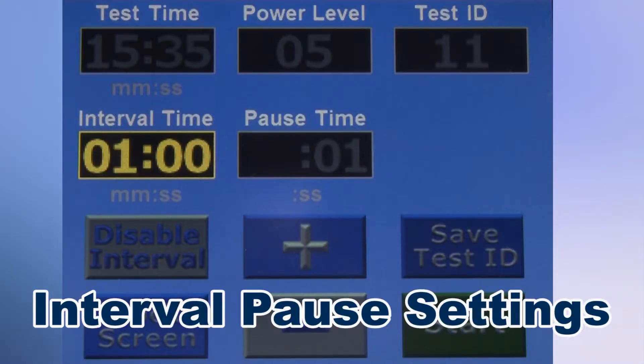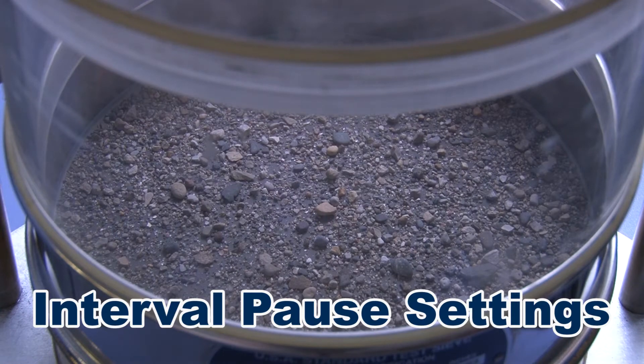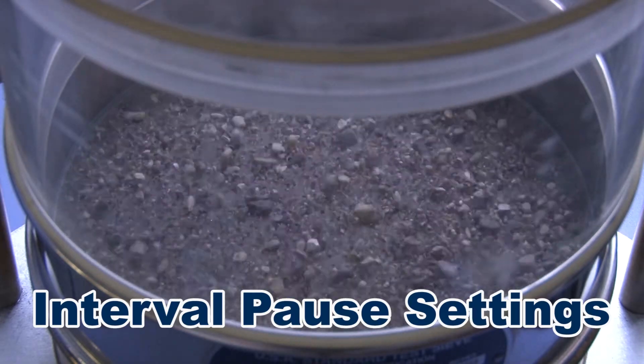The SS10 also has an interval pause feature, where pre-programmed vibration pauses allow materials to come to a rest, then resume vibration to mimic tapping action that reorients and redistributes particles to clear the mesh.